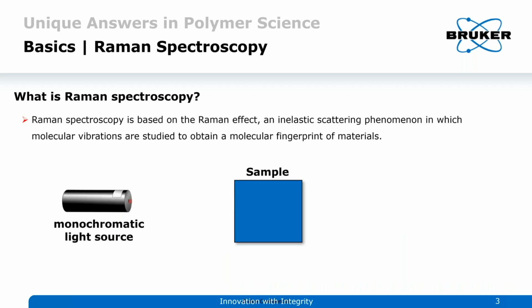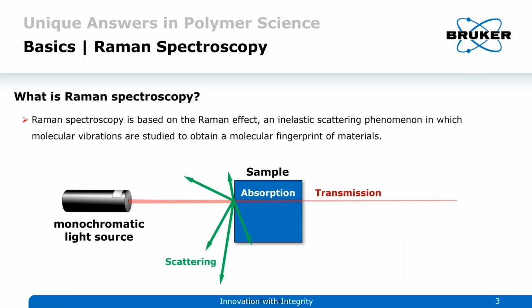We're also going to go through a couple of examples with Raman. So what is Raman spectroscopy? Just like in our previous example, where we sent a broadband light packet to the sample, now you're going to send just monochromatic, single-wavelength, very bright light to your sample. Historically, that's been a laser. So we'll use a laser, one of many different wavelengths typically available on our systems, and we'll look at the inelastic scattering that we do the detection with. We're actually not interested in the light that passes through, and as it turns out, that is the majority of the light that doesn't interact with the sample.